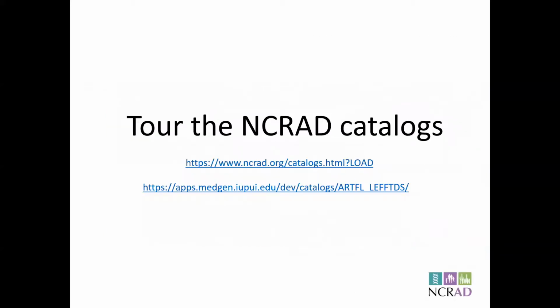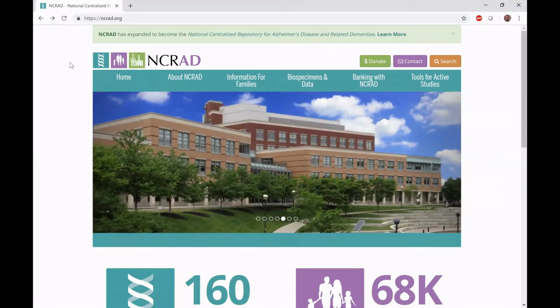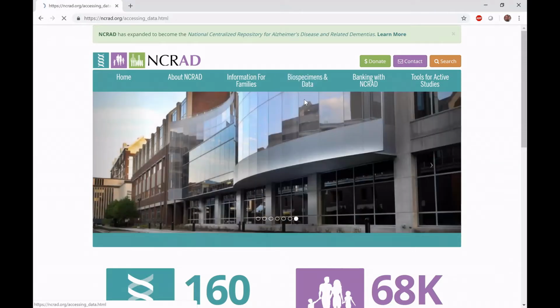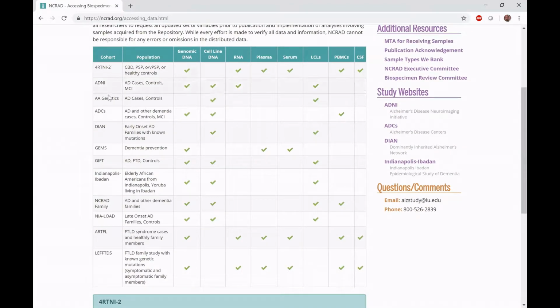We're now going to start a tour of the NCRAD catalogs. My name is Chris Hobick, and I will be walking you through the NCRAD online specimen catalogs. To access the catalog, first go to www.ncrad.org. From there, you can click on Biospecimens and Data and Accessing Biospecimens and Data. On this page, you can see all of the studies that are currently distributing through NCRAD, the population of the subjects, and the individual specimen types available for request.